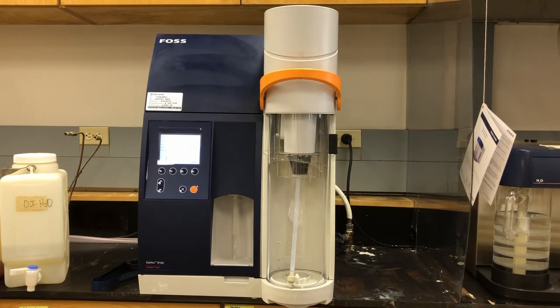So this is an automatic distillation unit. And inside this machine, what you can't see, there is a heating coil which heats water to produce steam, and a condenser as well. So we heat the sample, which liberates the ammonia, and then it is distilled by steam for about 5 to 7 minutes through a condenser, and then the ammonia is collected in the receiving flask.